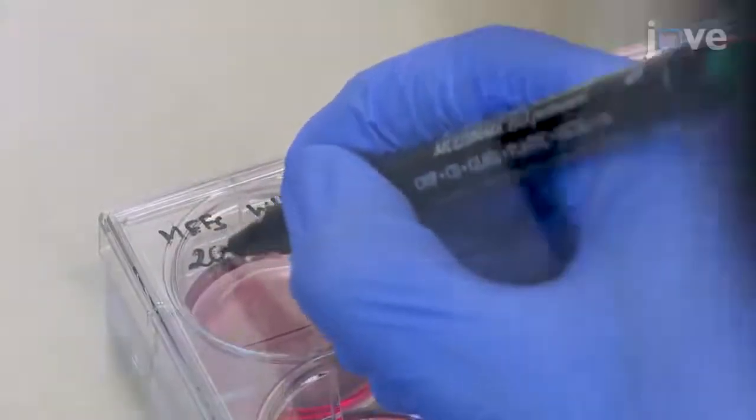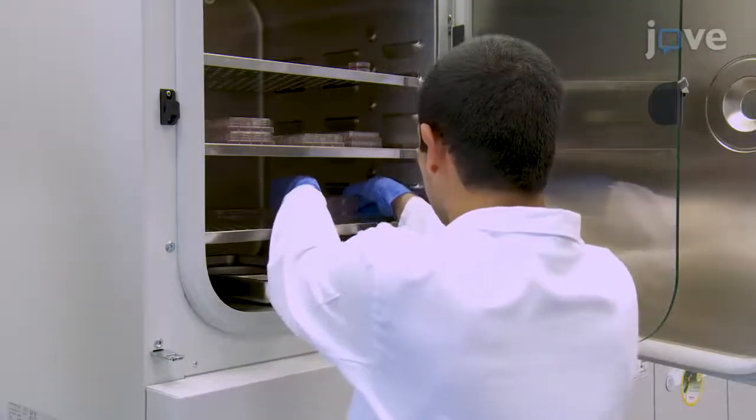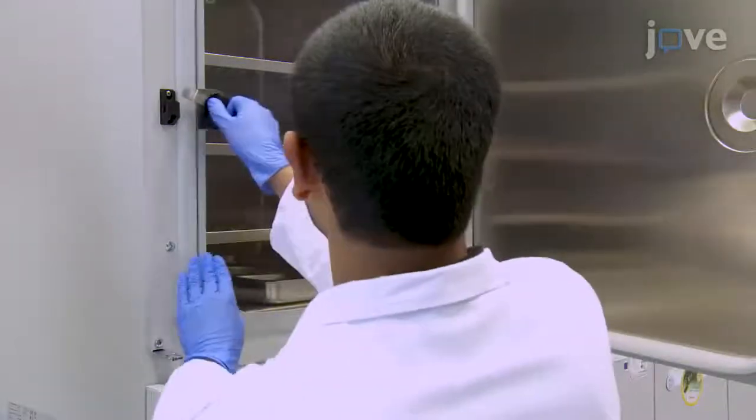Label the plates with the cell type, genotype, and date, and place the plates in the cell culture incubator for 24 hours.